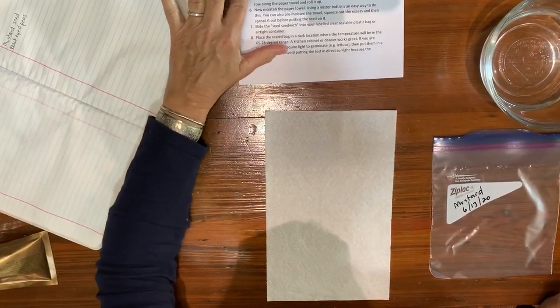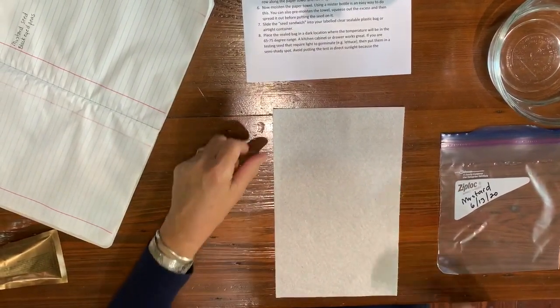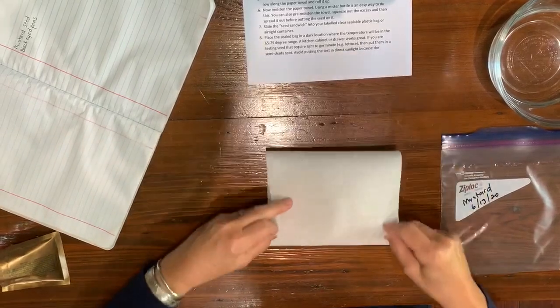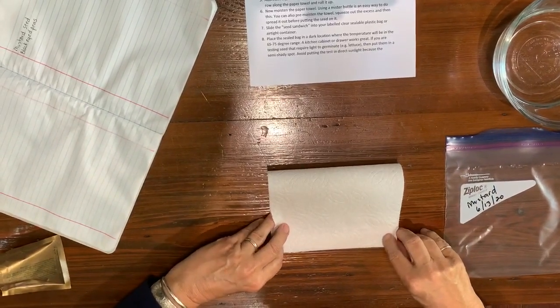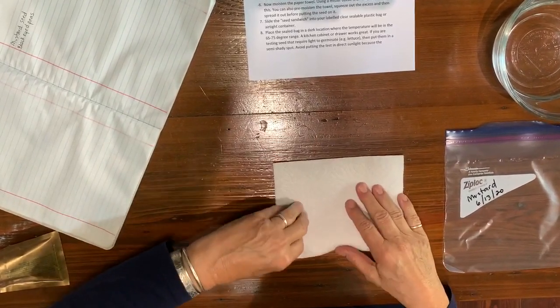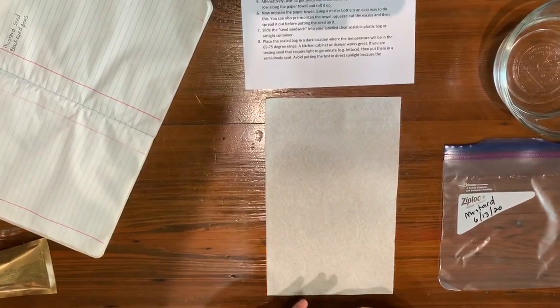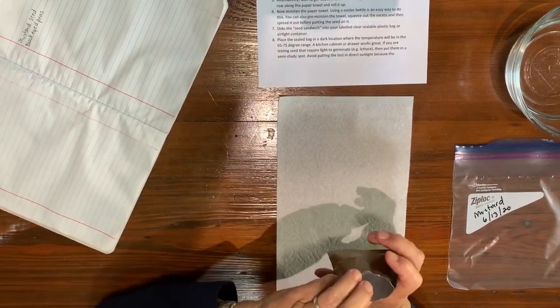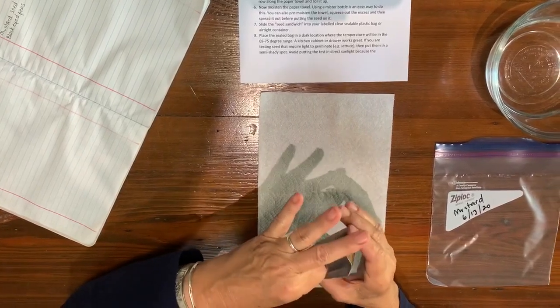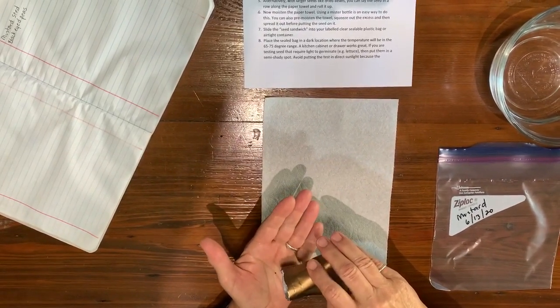Number two says fold your paper towel in half to make a crease. This is half of a paper towel — you want to fold it and make a crease, then open it back up. Then count at least 10 seeds from the packet. Here's my seed packet. If you want to use multiples of 10 that's fine, but using 10 is easy.